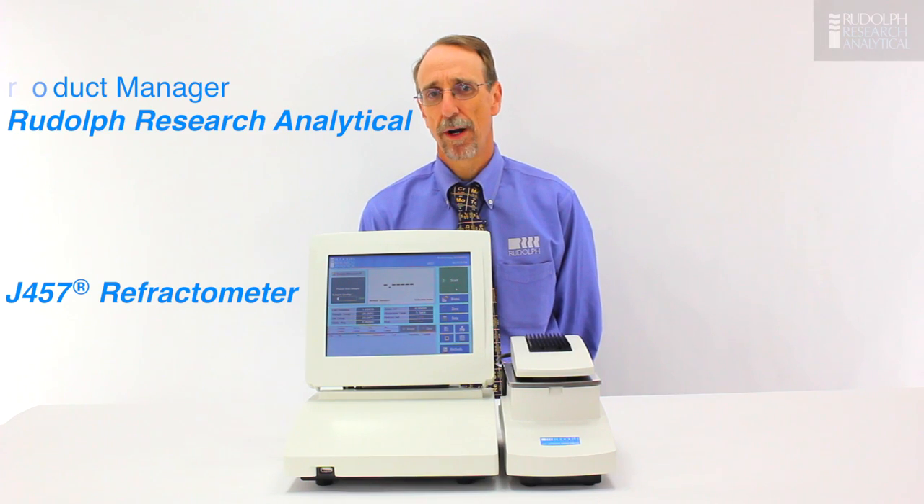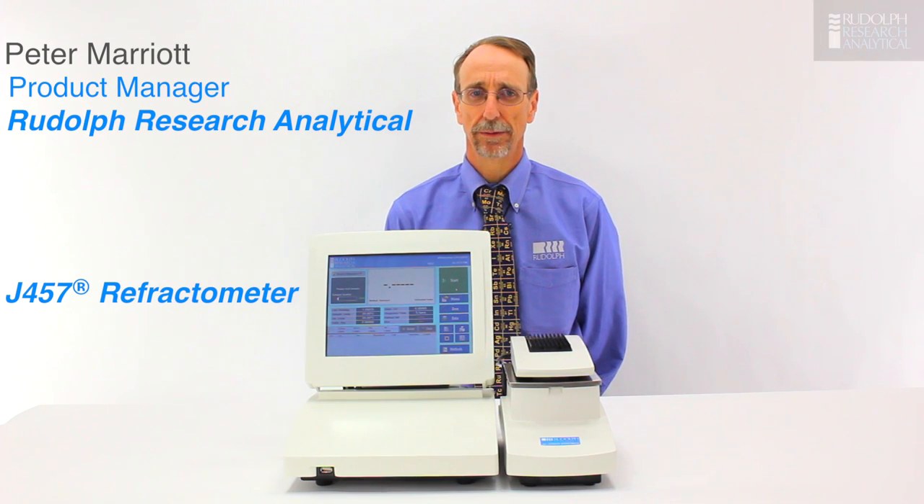Hi, I'm Peter Marion. I'm a product manager at Rudolph Research Analytical. Today I'd like to give you an overview of Rudolph's latest and most advanced refractometer, the J457.